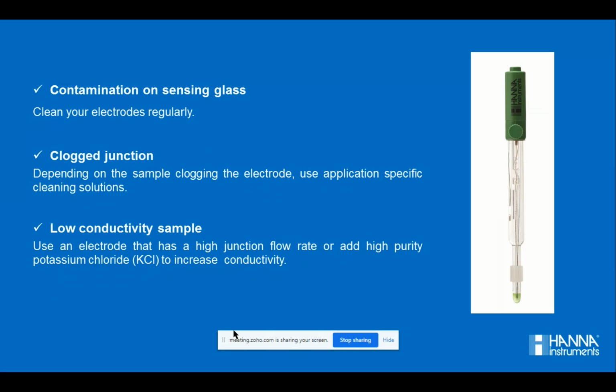So, depending on the sample and the clogging of the electrode, use electrodes that are specific to your samples. Like you have separate electrodes for wastewater samples, you can have a separate electrode for normal water samples, and so on.